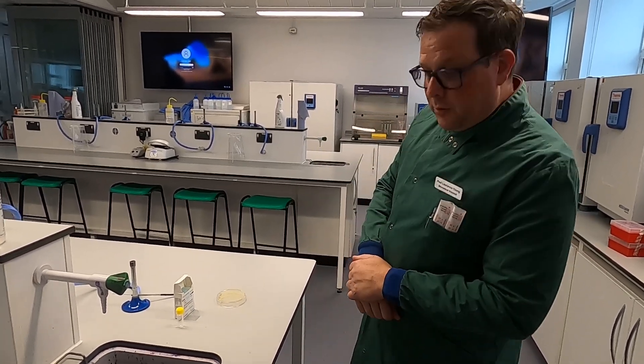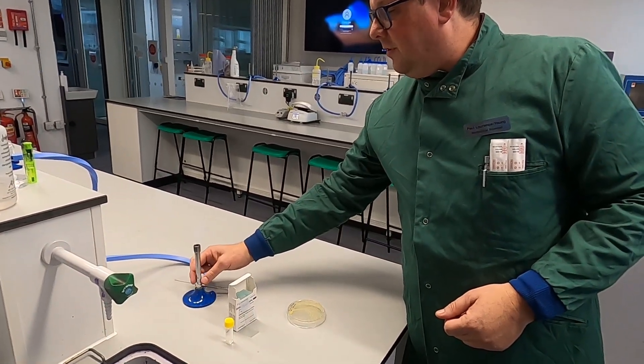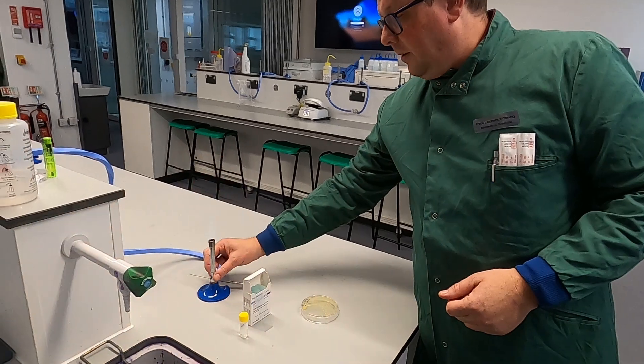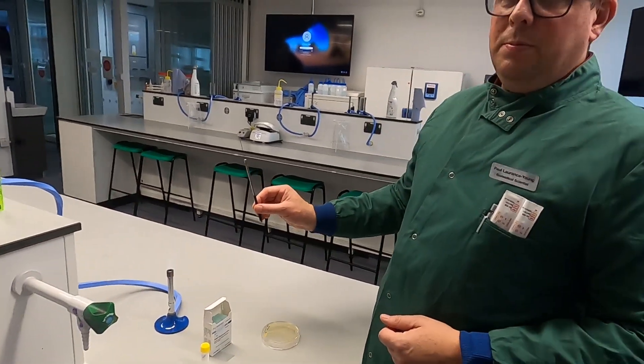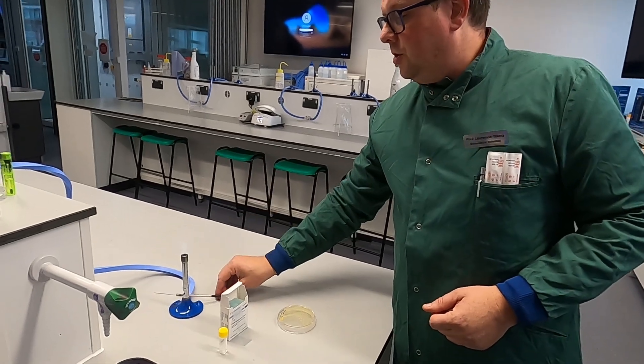To do this you need a few items, namely a Bunsen burner set to raging hot — not the safety flame, which doesn't actually achieve an awful lot. You need a loop sterilized by passing it through the flame to ensure that nothing is on there that shouldn't be.